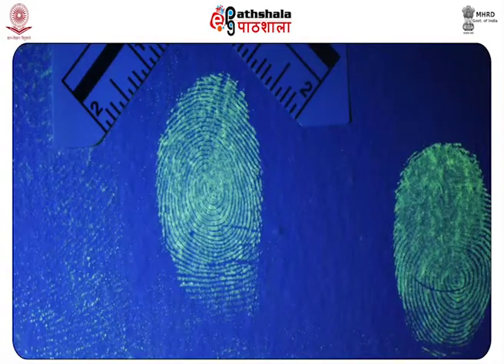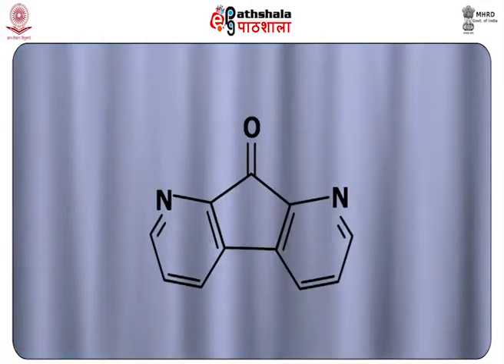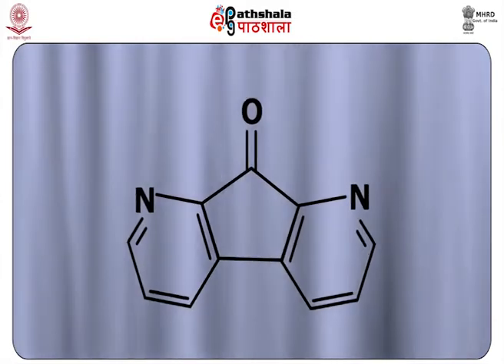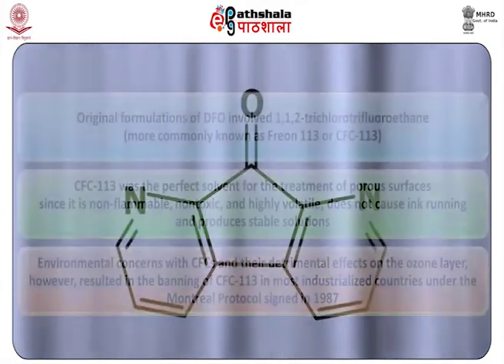As a result, reagents which give colored derivatives on interaction with amino acids render visibility to both fresh and old fingerprints on a wide array of surfaces. It is therefore not surprising that amino acid specific reagents have been used in several casework investigations. One such reagent is 1,8-diaza-9-fluorenone, abbreviated as DFO.